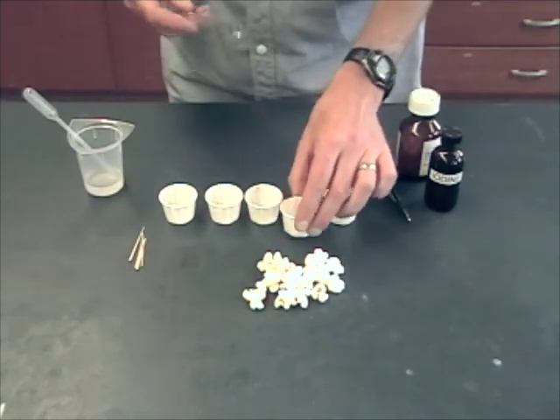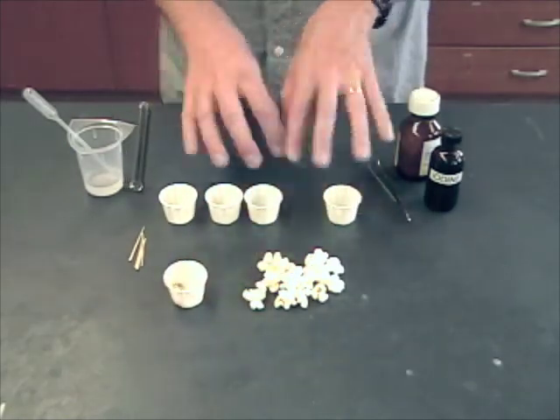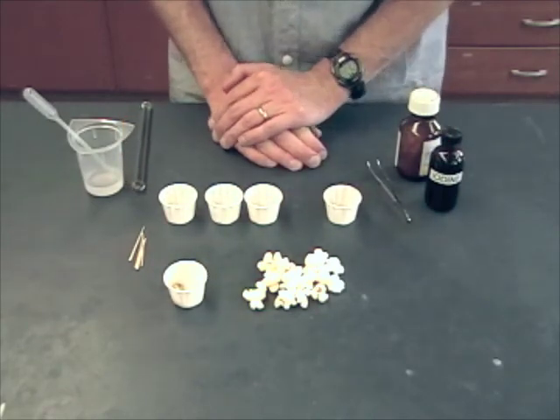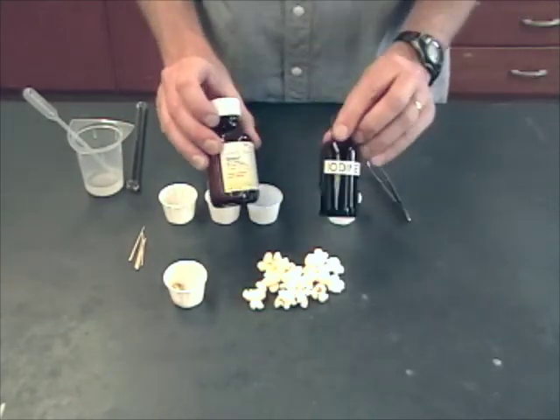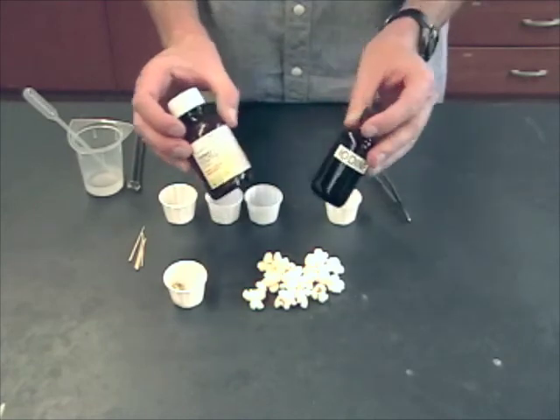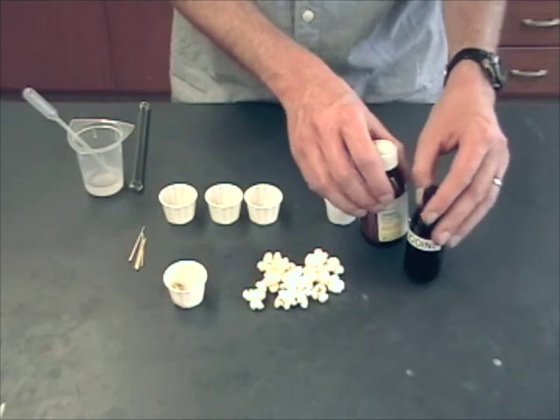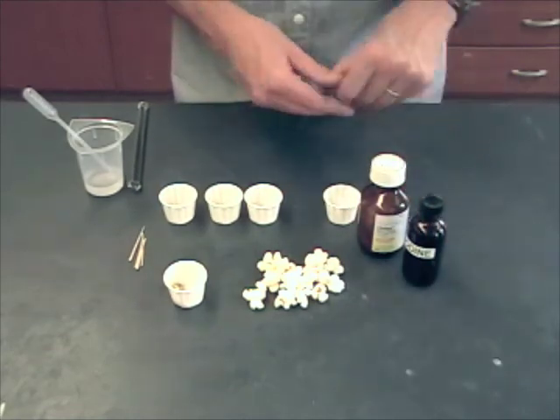Okay. So that's one example of the sort of test that you can do. So you're going to have five cups. Each group gets just five total cups to work with. And then there's also these two reagents. There's iodine and ClinTest tablets. One of these is a test for starch. One of these is a test for simple sugars. And I'll let you and your group figure out which is which.